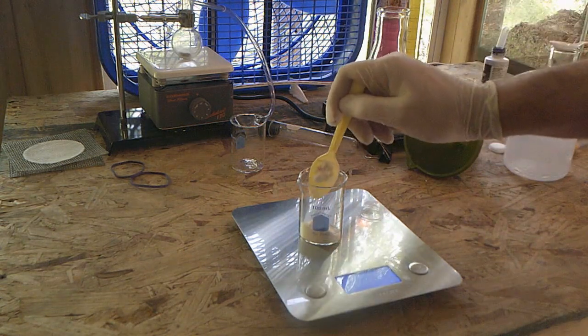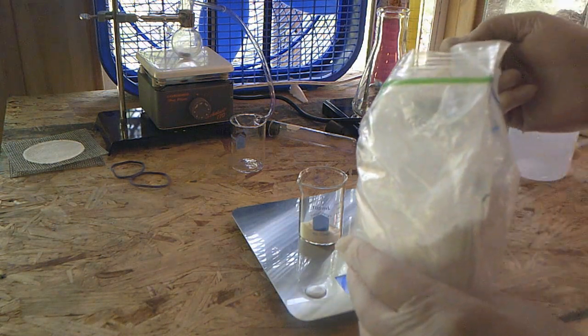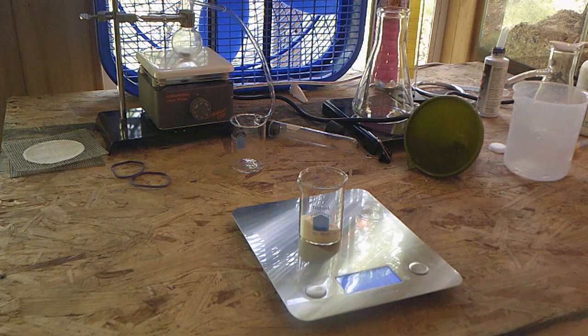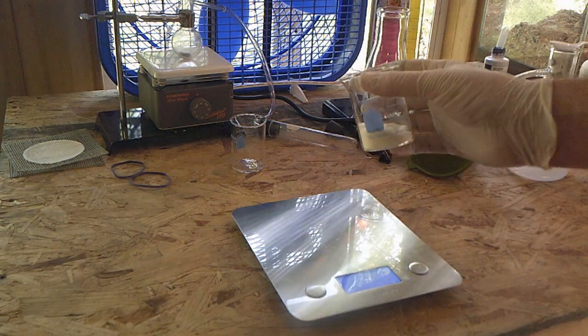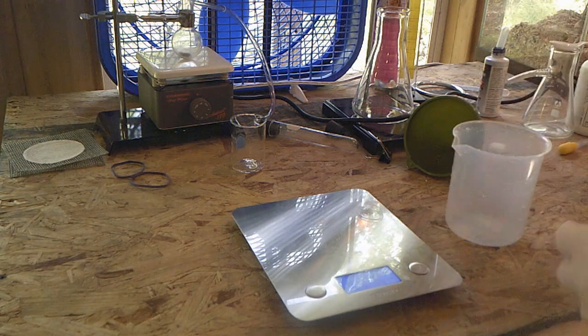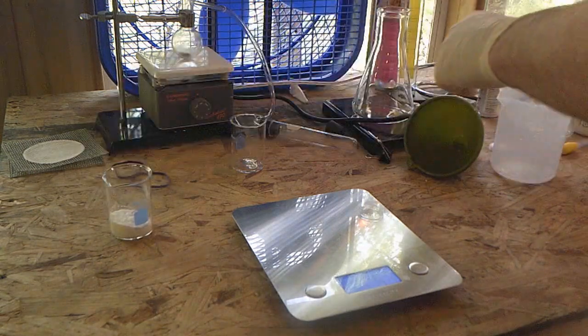It's not a very dense compound. It's pretty light and fluffy. So we're going to put a lot in there before we get to about 8 grams. There we go. Okay, went a little bit over, so that's going to be 10 grams of dextrose. Now this is the sugar. In the reaction, this is the species that is going to allow us to go from blue back to colorless. So this is what turns methylene blue into a colorless liquid. So let's set that aside.